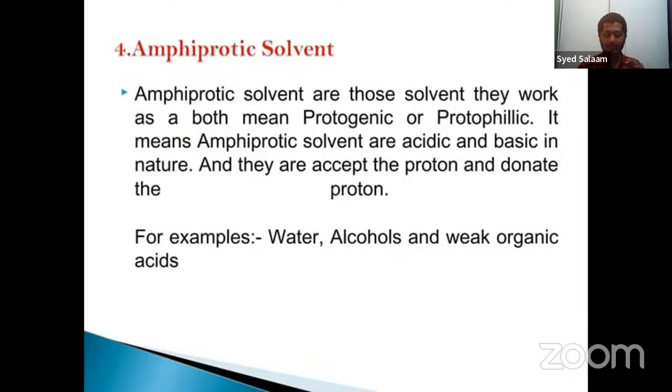And apart from this, we have certain major advantages. Examples of non-aqueous titrants: you can see we have perchloric acid, sodium methoxide, and potassium methoxide. Likewise, we have a list of examples.